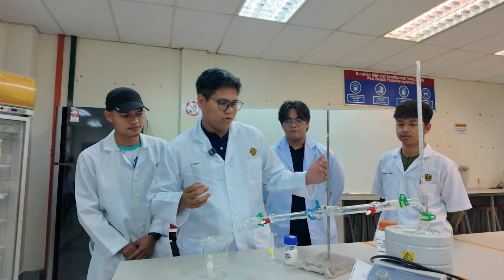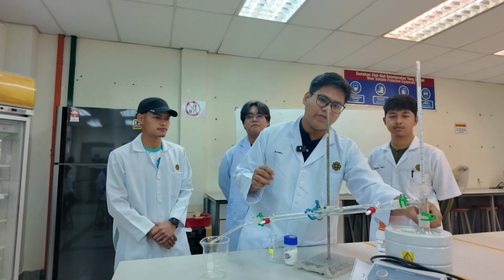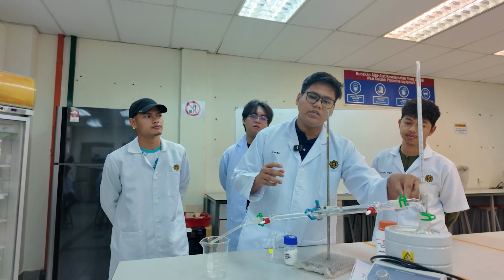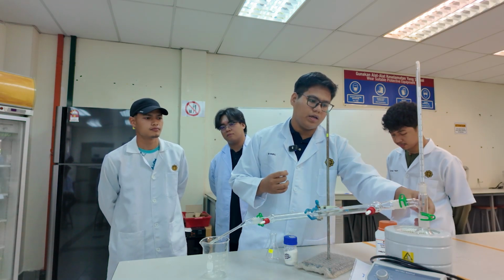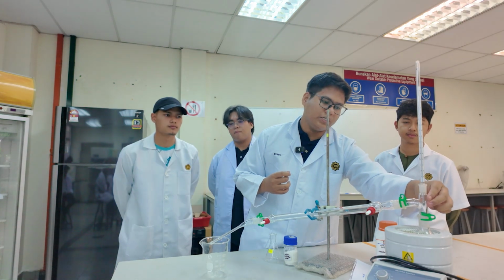So the apparatus that we see here, the first one is a round bottom flask. The round bottom flask is used to hold the impure water that we want to separate. And the next one is the distillation head.